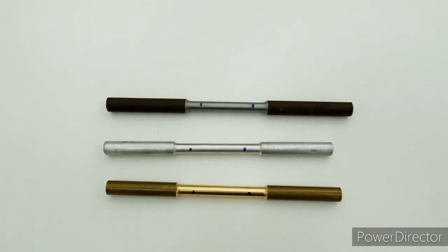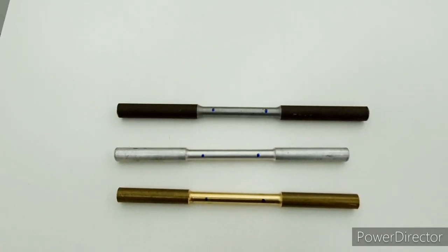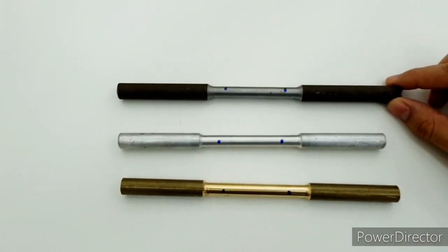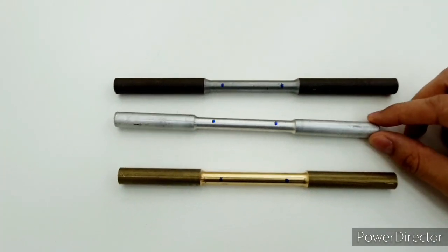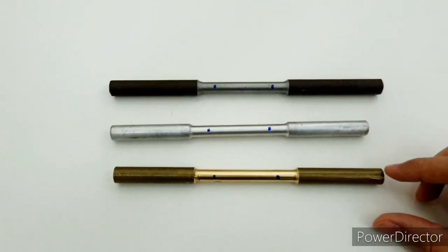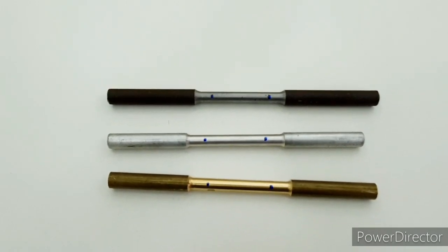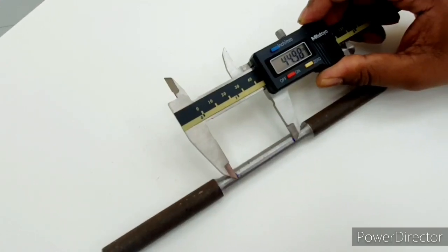These are the 3 samples that are going to be tested in this machine today. The first one here is the steel material. The second one is the aluminum material. The third one is the brass material. And let's proceed with the sample measurement first.